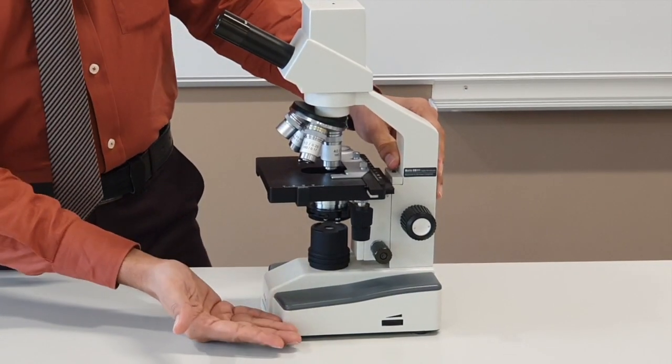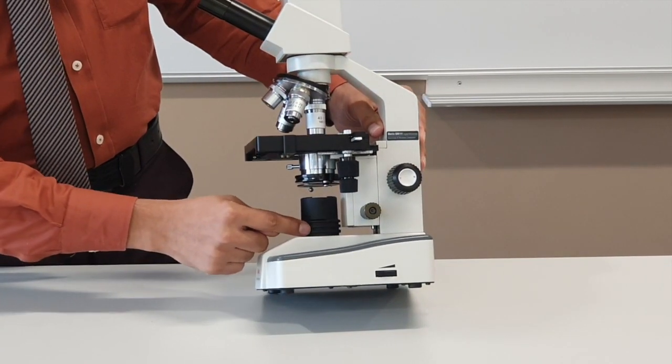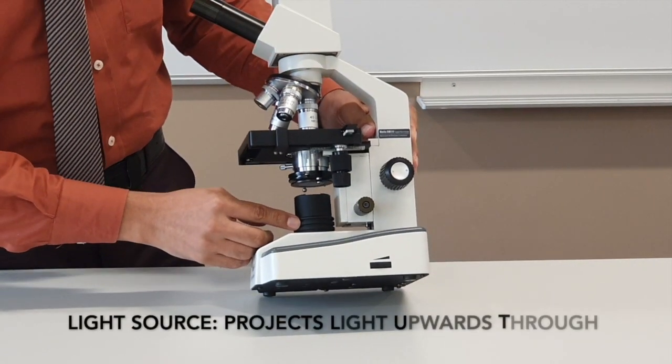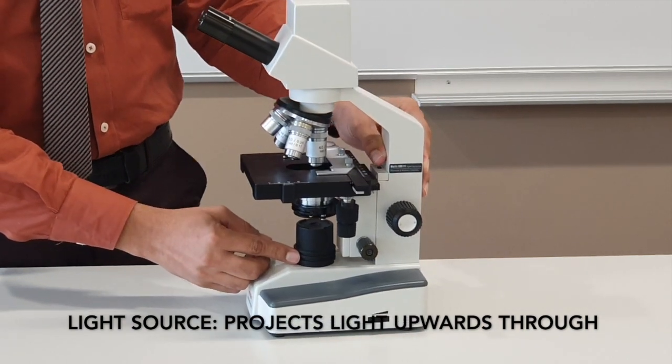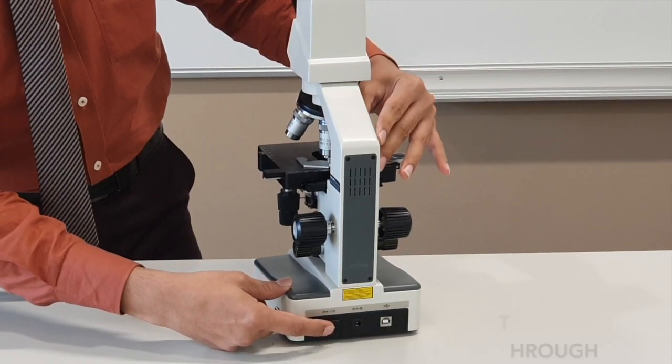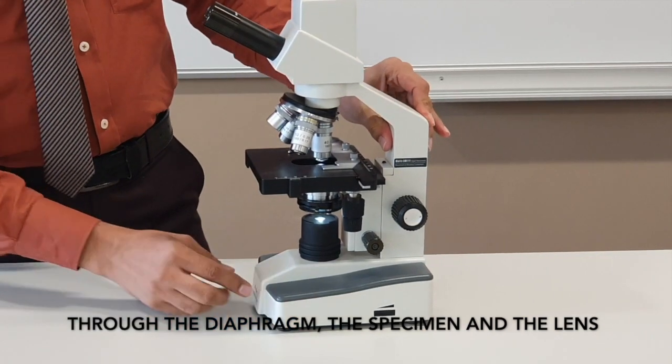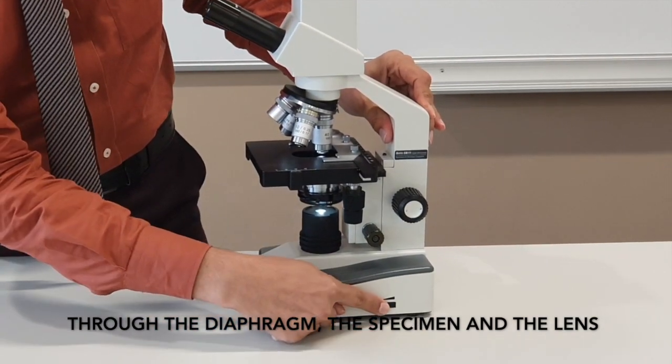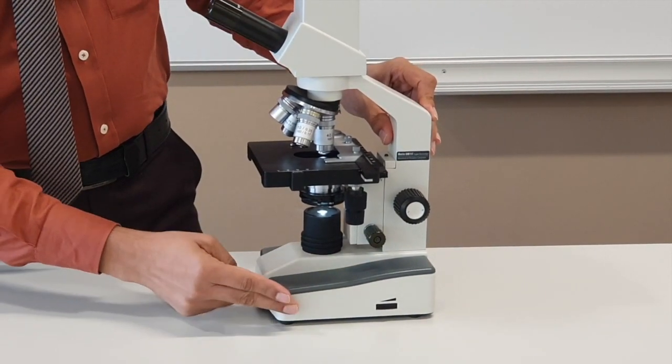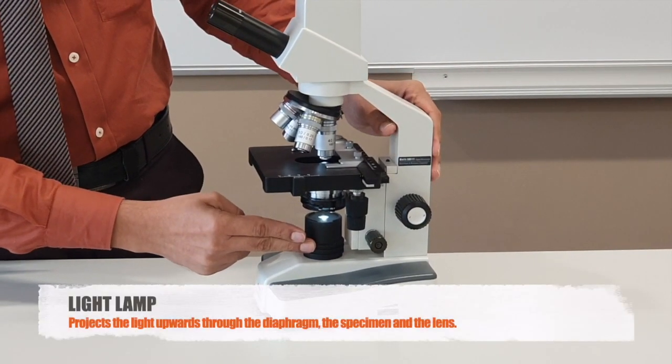If you go a little above the base, we have this area called the light source. Most students try to look into the microscope but don't see anything. Don't forget that behind each microscope you have a small button and you need to turn it on. That will help you to see through the microscope. To increase or decrease light intensity, you have to use this button.